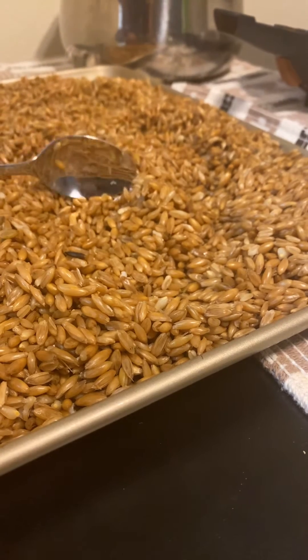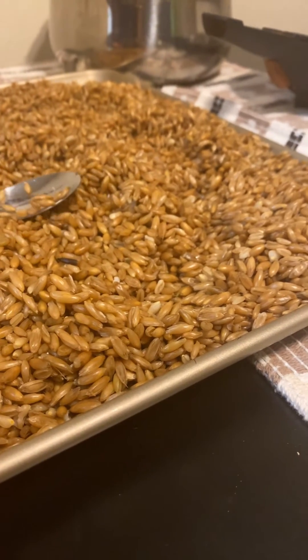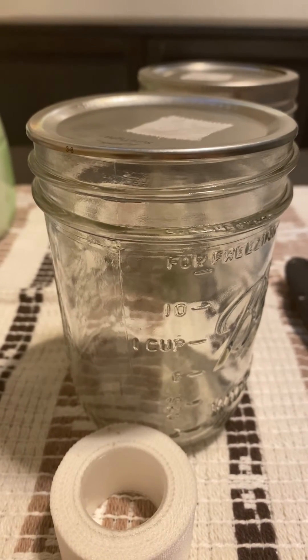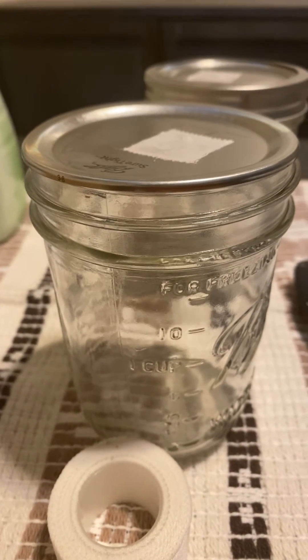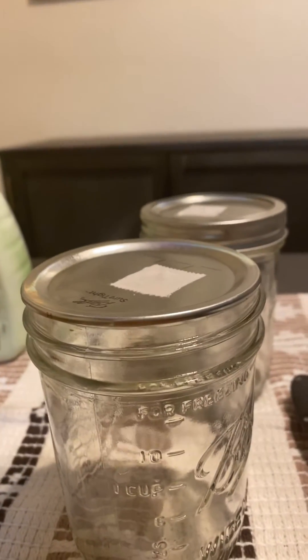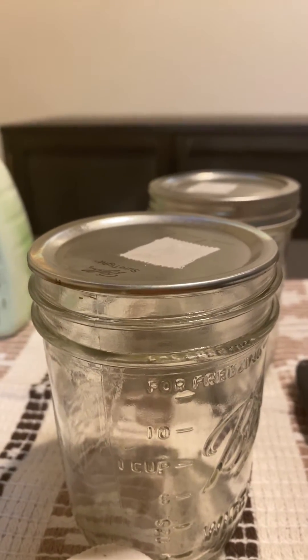When these whole oats dry, we're going to scoop them up and move them into these pint jars. We're not going to use a quart jar because quart jars are a lot bigger, and it's going to take a longer time to colonize.